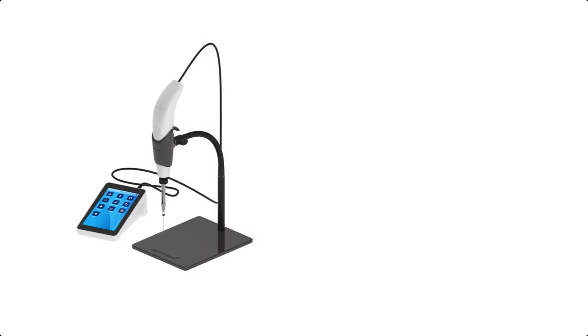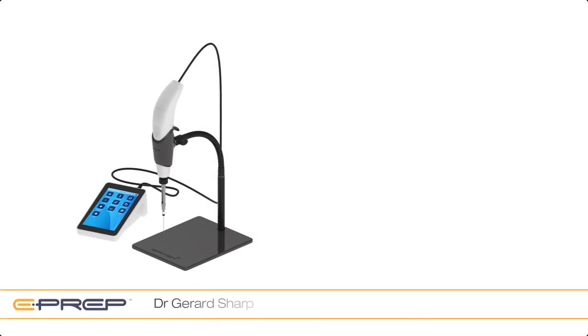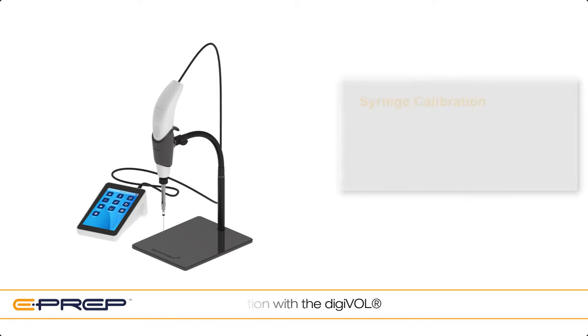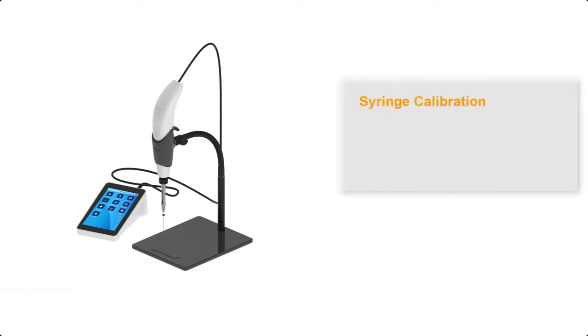Hi, I'm Gerard and in this short video I want to show you how to calibrate your syringe with the Digivol. The main reason to use syringe calibration is to further improve the accuracy of a dispense volume from a syringe.